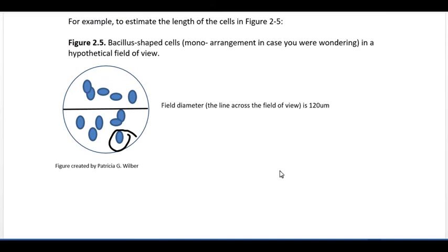I'm going to guess that somewhere around, if I were to line these up, 1, 2, and this would be nice, we could do this on the microscope, of course, we can't. So 3, maybe I got a little smaller, 4, 5. So let's say I'm going to guess 1, 2, 3, 4, 5, 6, 8 cells fit across.